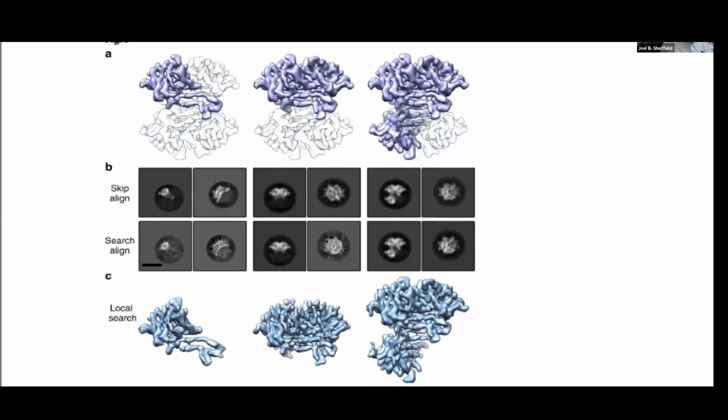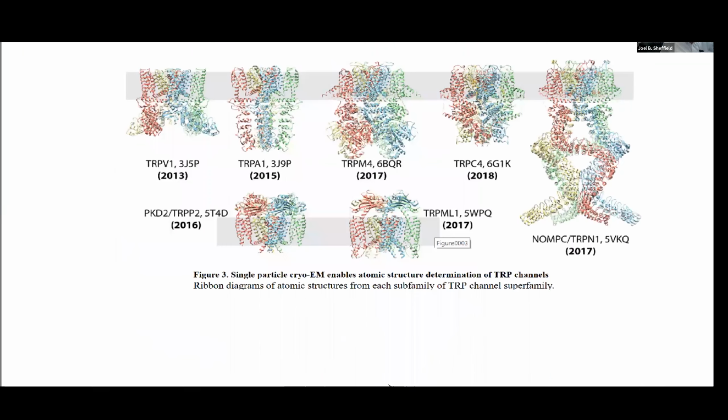Here's another example from that same paper showing how they're really able to do this kind of very elaborate alignment, which then gets refined by slightly different perspectives and eventually ends up creating this image at this point, which is the resultant of it. Okay. And then to take it even further, what people are now able to do is develop the resolution. They're showing something about the progression of how much detail becomes possible over a 5-year period.